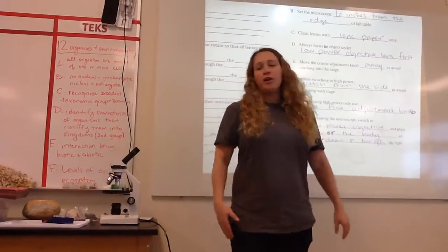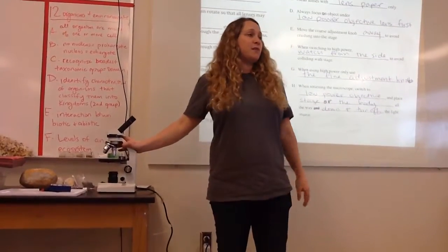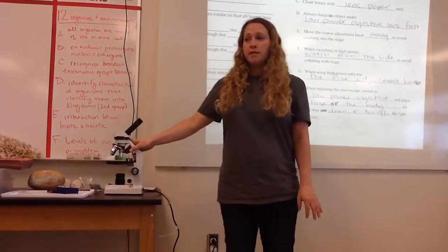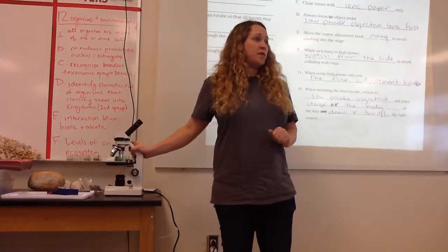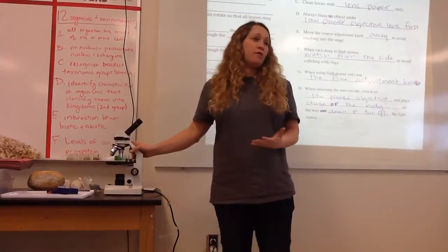Alright, students, today we're going to learn how to use the microscope. It's very important because the microscope is an expensive piece of equipment. Very soon, on Monday, you're going to have a microscope quiz, and in order to use this very expensive piece of equipment, you're going to have to pass the quiz with an 80. So it's very important for you to learn this, and also it's important to take care of the equipment.